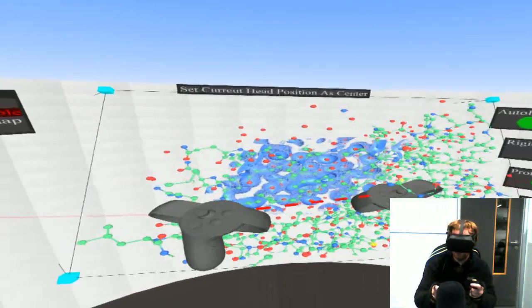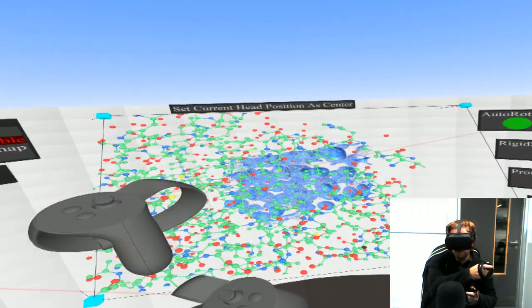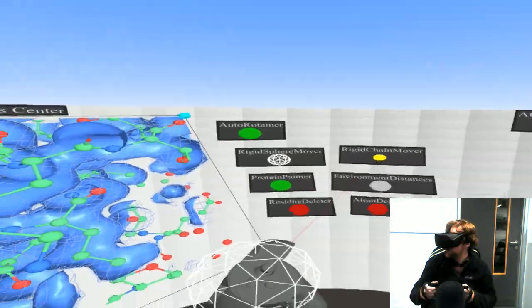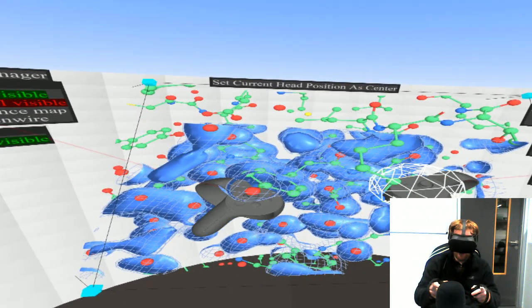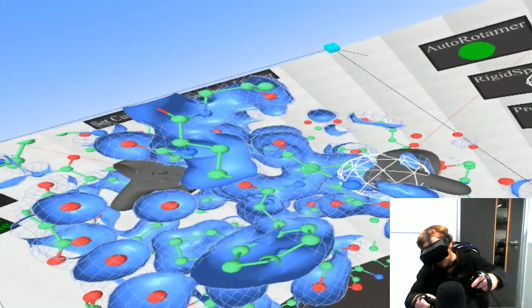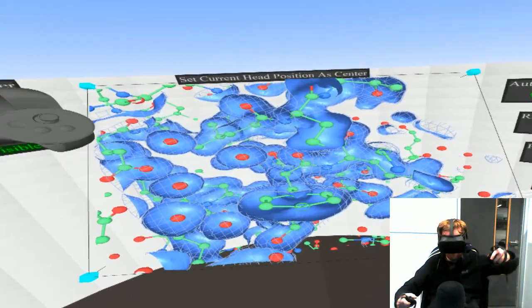If I resize it, my tool stays the same size, so I can actually grab a very large group of atoms. This is a version of the same thing, but right now, if I grab with this, I should get this set of residues here, and I can have my hands be as far apart as they like on the chain.